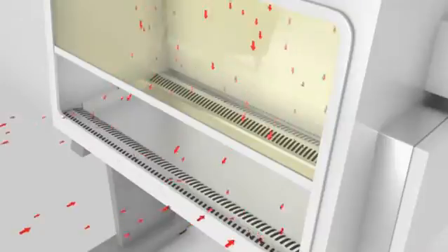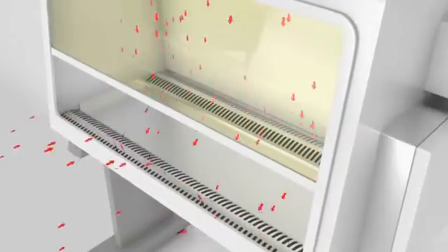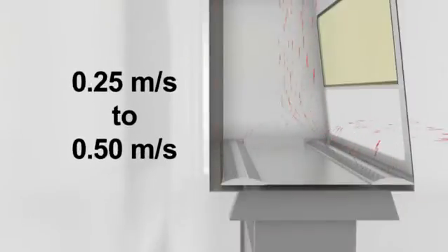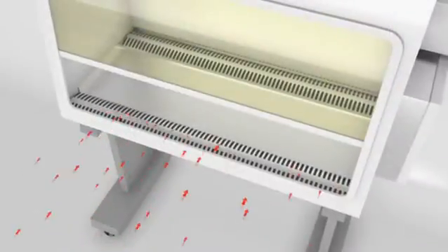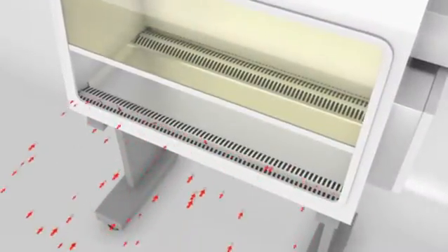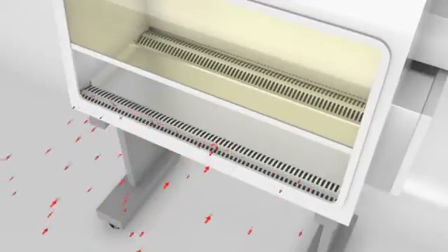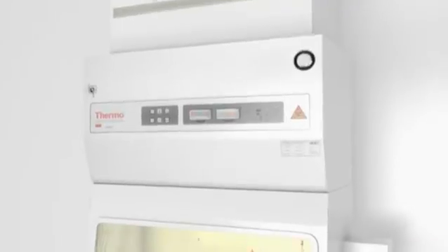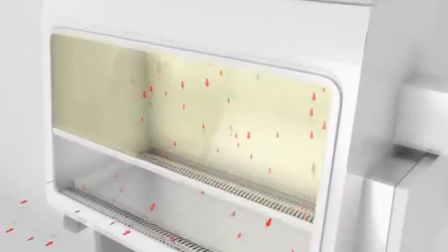Air flow in a class 2 microbiological safety cabinet is measured as downflow. This downflow rate should be between 0.25 metres per second and 0.5 metres per second. An internal fan draws room air into the cabinet through the front opening and into the front intake grill. The air then passes through a HEPA filter before flowing downwards over the work surface.